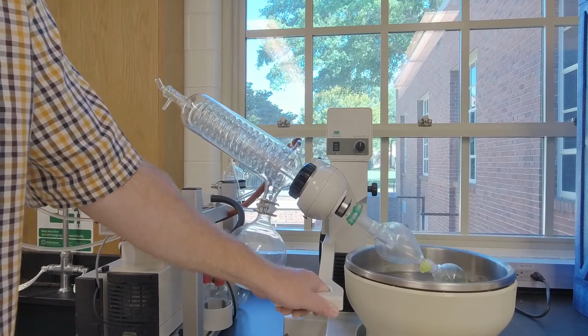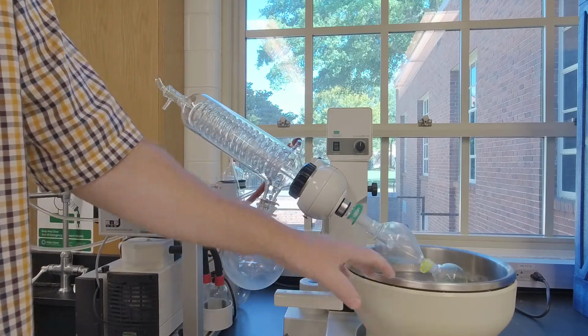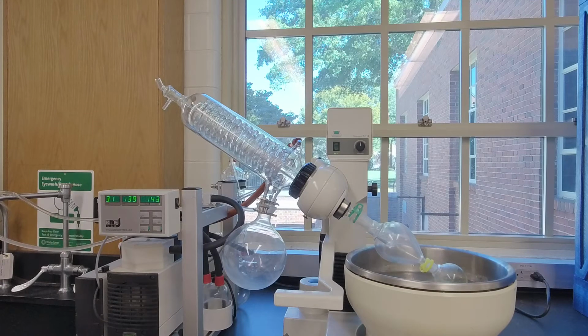We're not really heating, we're not boiling it. We don't want this bath to be super hot. We just want it to be warm enough to keep the solvent at its reduced boiling point.